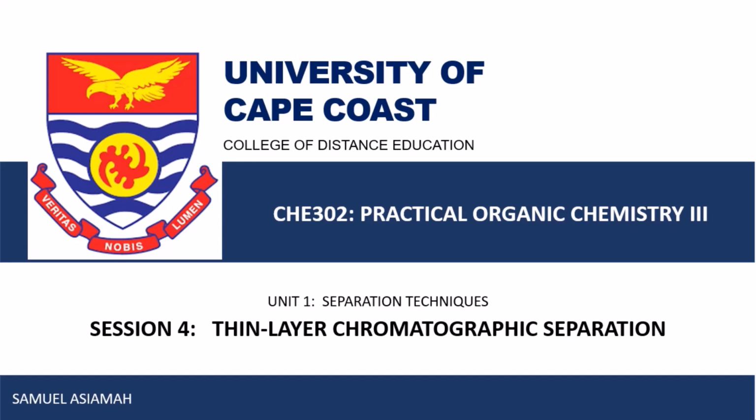Hello everyone, and you are welcome to the fourth session under Unit 1. And here we are going to look at thin layer chromatography.